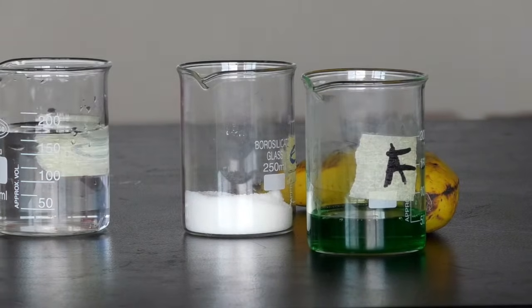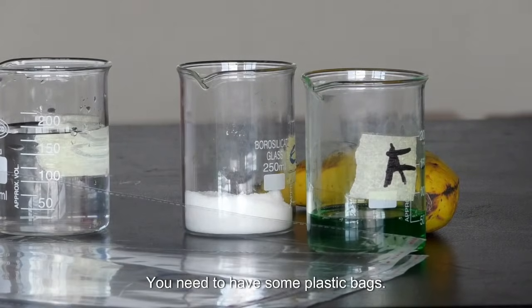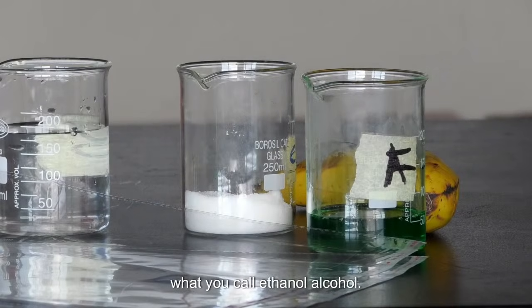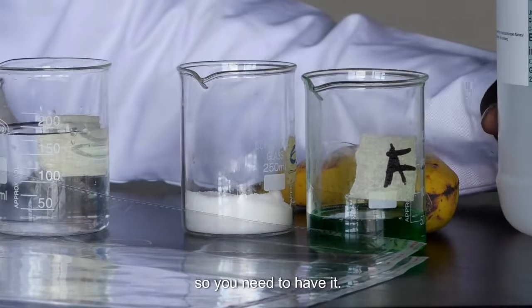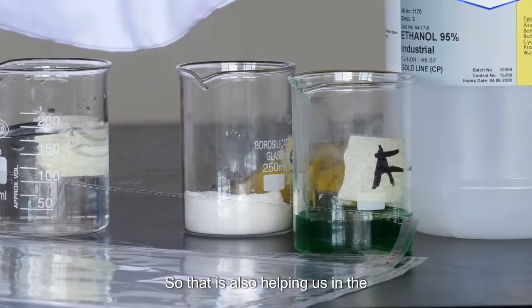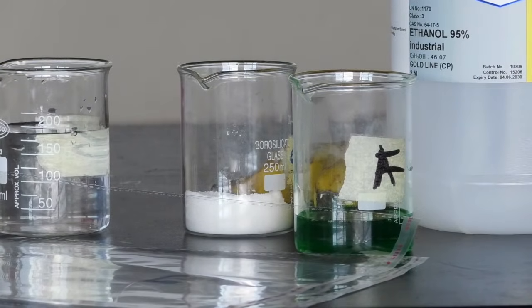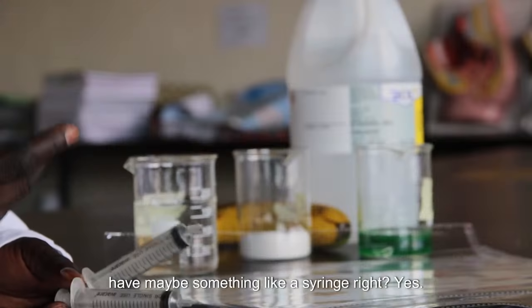And then you need some plastic bags. Then you need ethanol, alcohol. Yes, ethanol, alcohol, so that it also helps us in the extraction. Then you need test tubes. If you don't have test tubes, you can use something like a syringe.